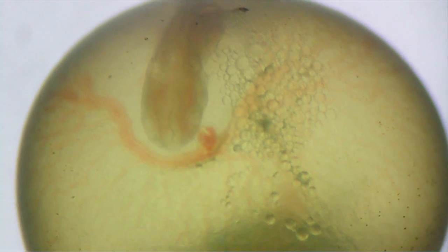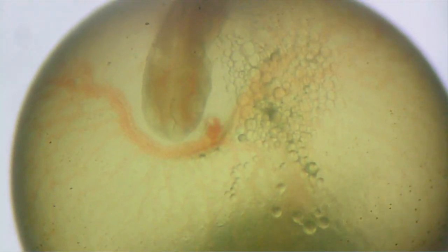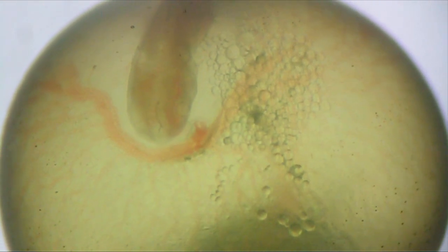Here you can see that the heart is a little slowed down. We've reduced the speed so you can see the motion of the heart bumping both chambers and the blood as it's flowing through the veins in that stop action.